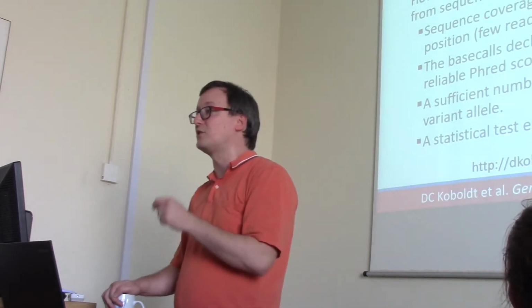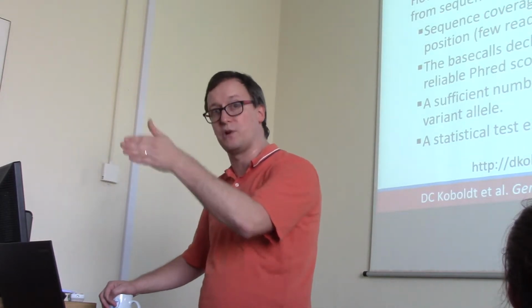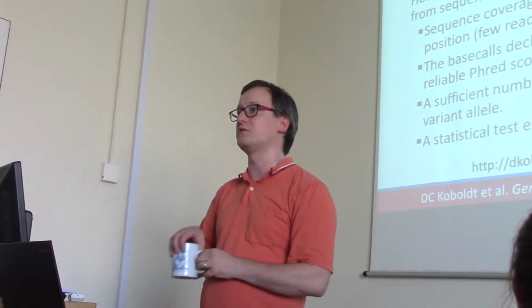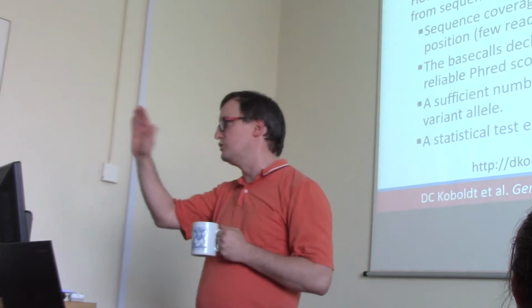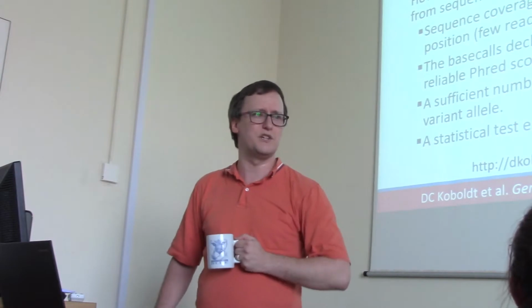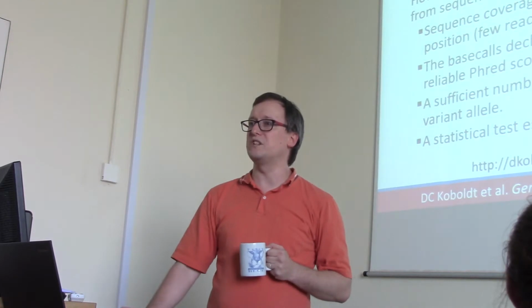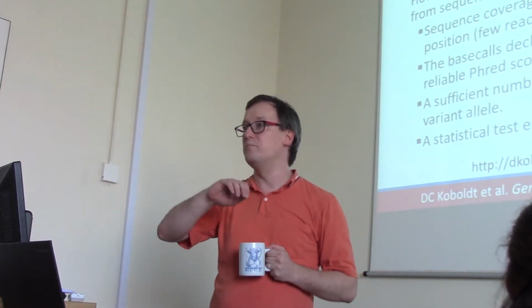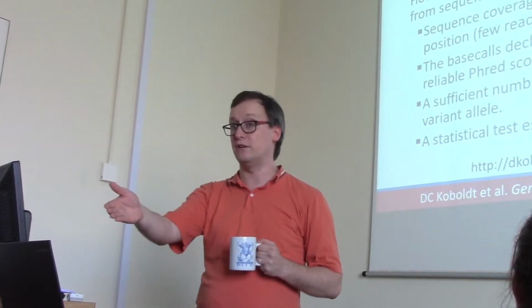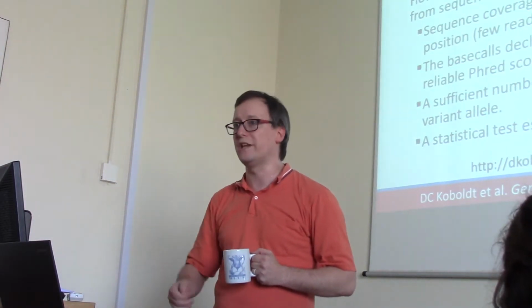So we need some sort of statistical test to evaluate the probability that the reference differs from what this person has at this location. That said, when we use modern sequencers to compare any person to the total genome reference for humans, you're going to find bazillions of differences for any individual human, simply because the human genome is so bloody big. So we really want to be very, very careful about miscalling sequence variants just because one read happens to show a different letter at some location. It's quite easy in such a huge volume of data for an individual letter to be wrong.